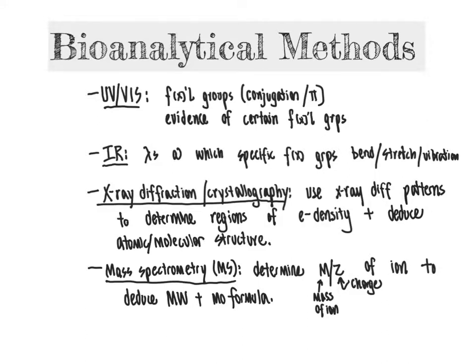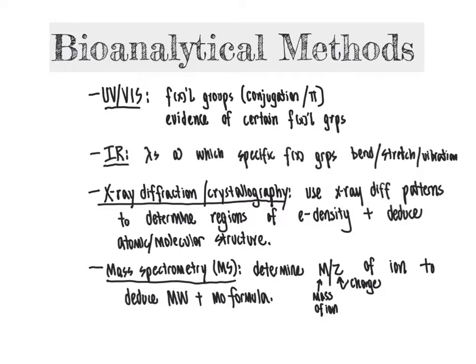But usually with a mass spectrum, you can't determine the complete structure of a molecule that was initially totally unknown in structure. So usually the full structure will remain a bit ambiguous unless you have some standards to compare your mass spectrum to, or your compound of interest is very closely related to a previously known compound.